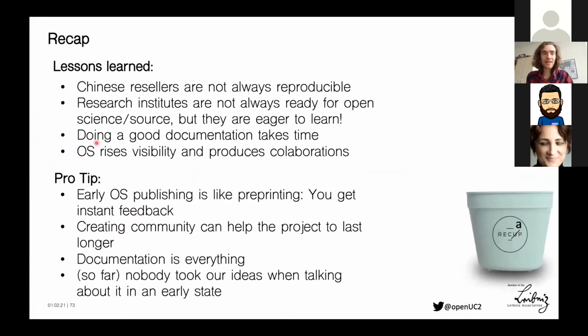So, recap, lessons learned. The Chinese resellers are not really reproducible in the sense that you buy stuff once and the second time it may be a little bit different. For example, the hole position of the XY stages is sometimes a little bit different. Also, buying stuff from China is not super easy, because our institute, and I think many other research institutes, don't like it because they don't really do the tax billing nicely.